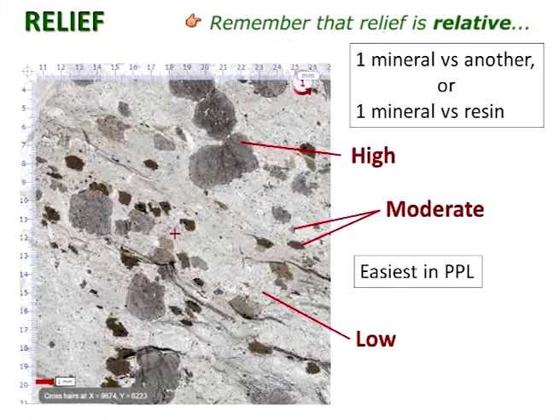Some of the matrix grains might be mixed up, and there may be more than one low relief mineral in that ground mass there, but you can pick out some of the individual minerals very well. And that's another thing to say in general about thin sections: it's always a good idea to start off looking at a wide view of the section. I'll probably reiterate that further on. It's very important when you're deciphering histories of rocks, but even for simple things like relief and mineral identification, it can come in very handy.